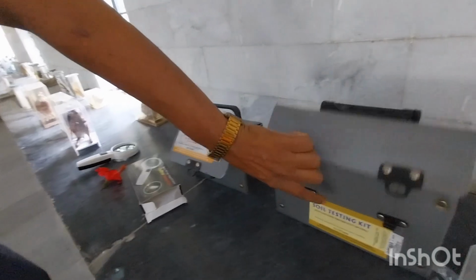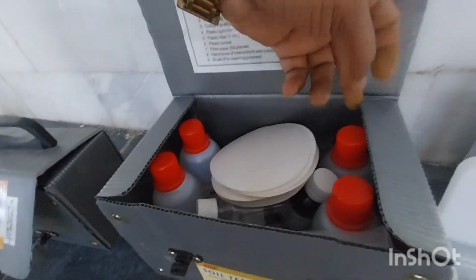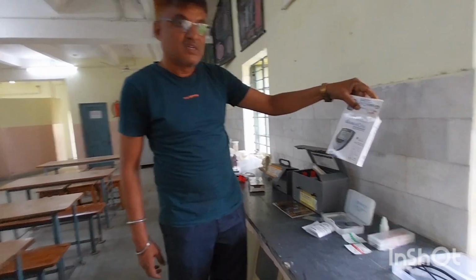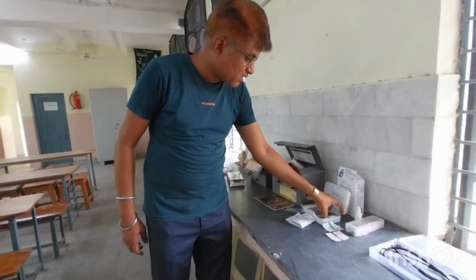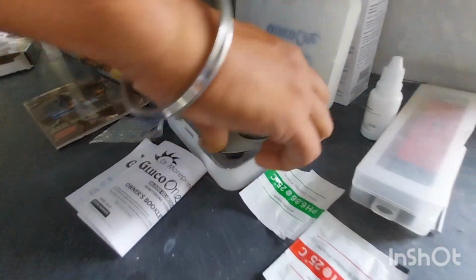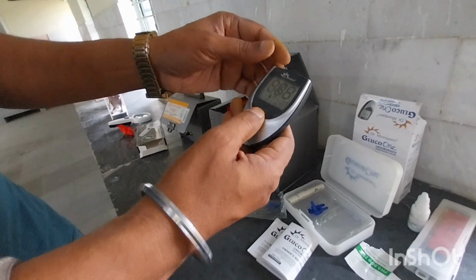Even we have the soil testing kit. Soil testing kit we have, and we can read the manual of the soil testing kit, and we can test the NPK, nitrogen, phosphorus, potassium, by using the different chemicals. And here blood glucose we can also measure. This is the glucometer we have here. With the help of this glucometer, we can check the blood glucose level also.